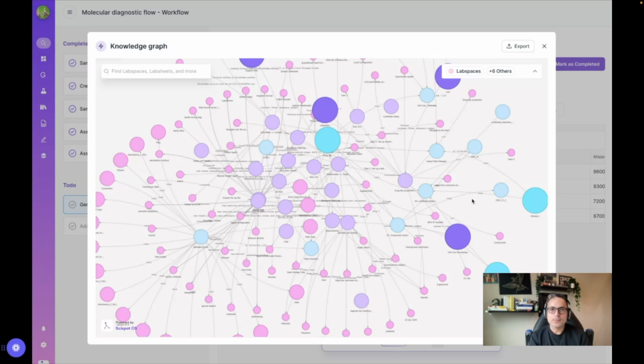You can hit that endpoint, and if you're feeding this as a training data set in your foundation models, you can do that, right? The goal is that if you are using an old school ELN and LIMS, it gives you an endpoint that cannot connect easily with your LLM infrastructure. The goal is to minimize that friction, right? So you basically use a modern data infrastructure where you can use the training data set for your particular use cases.